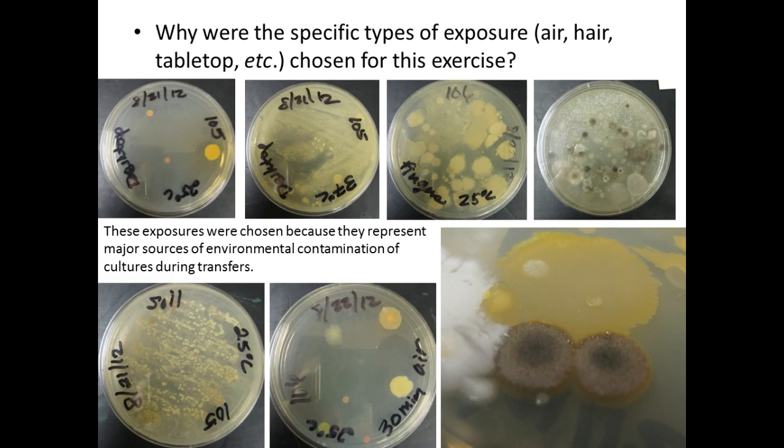We know our fingers are a source of contamination. Our desktop could be a source of contamination. Anything we track in from outside could be a source of contamination. The air even could be a source of contamination. So the way we work with our cultures, most of you guys that inoculated plates today, I had you hold the lid above the plate so that you would minimize the amount of microorganisms falling out of the air onto that plate and contaminating our cultures.